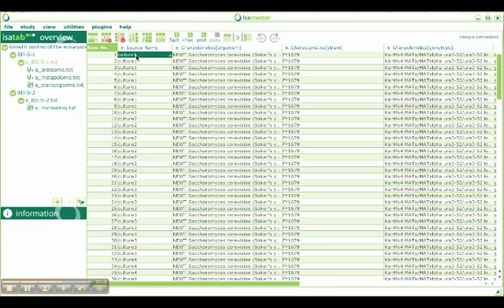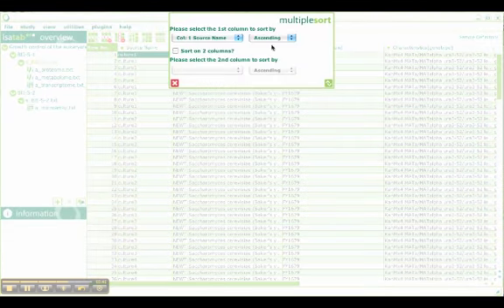But you need to activate the cell, as you noticed. By default, you can only add factors, which can be placed anywhere. Characteristics should be used to describe material nodes, and parameters to qualify a protocol. Then we've got the ability to sort by column, and you can just perform sorting a la Excel on 2 columns at the moment.